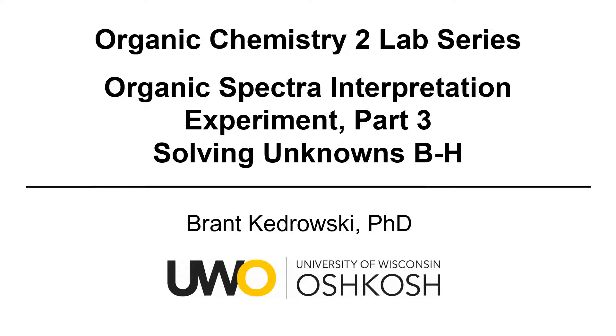Hello everyone, my name is Brant Kudrowski and this Organic Chemistry Lab video covers an organic spectra interpretation experiment. This is part three, solving unknowns B through H.